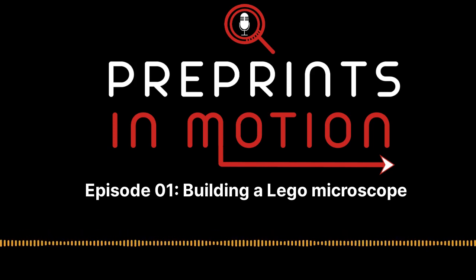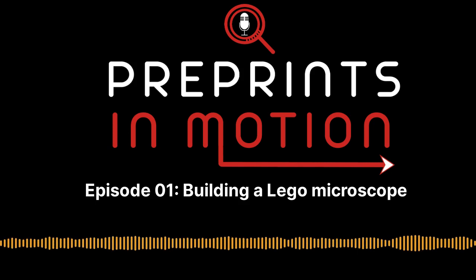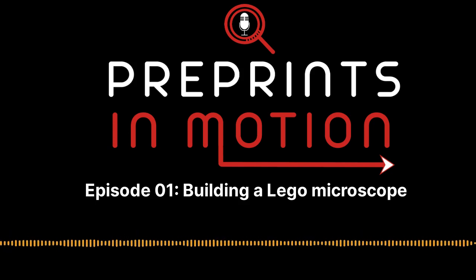So in the end, it was all a plan that was made before Corona. And in the end, we had to change our plans. But the original idea was that we would provide these sets to a school class where the students in groups of, say, 2, 3 would work on it. So we had devised building instructions. We had a help section to get them on the way if something wouldn't work. Questions on the way to explore the individual parts of a microscope. What does what and how does everything work together to, in the end, do what a microscope does. And then we had a few samples for them to play with.